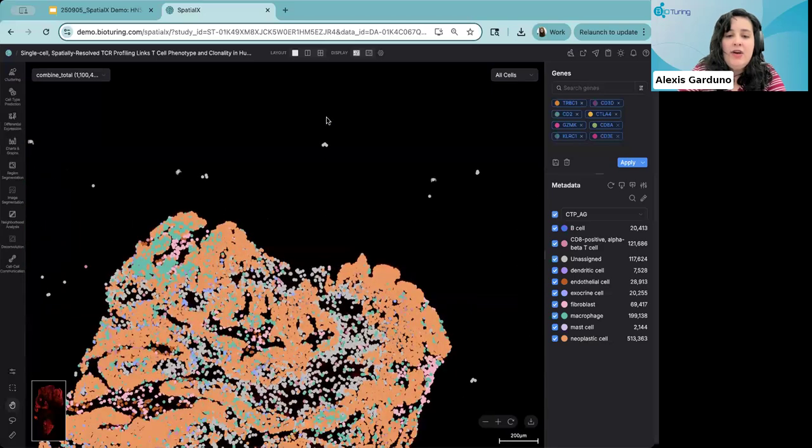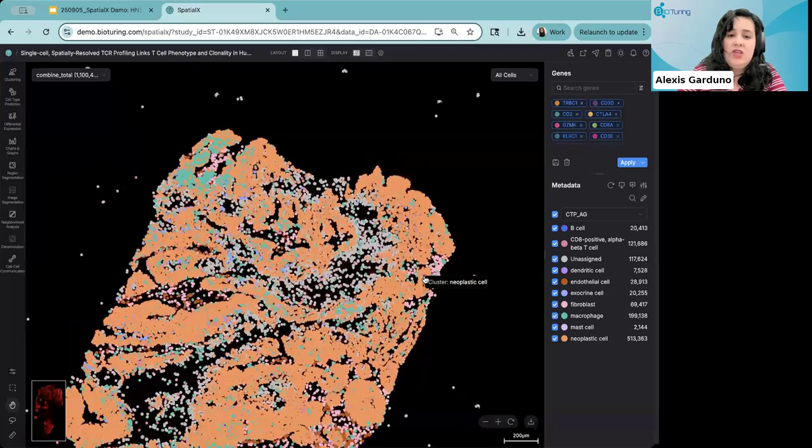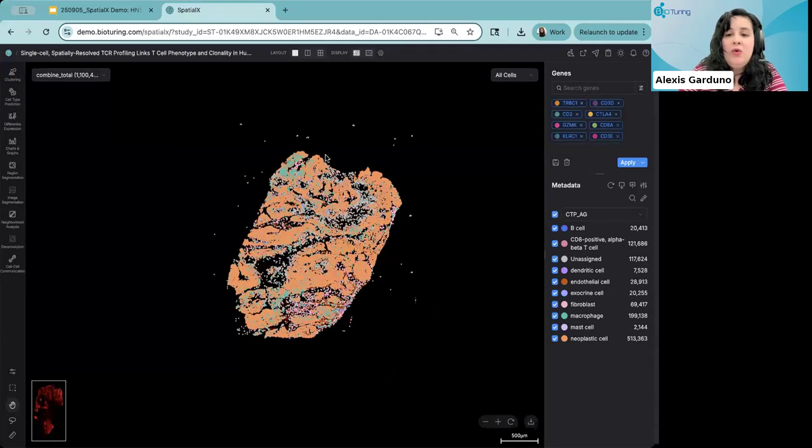in the system, and you're able to get more of an idea of what specific tumor sampling sites have specific tumor cells, which ones have the CD8 exhausted T cells, and what is the distance between these cells within the tumor. So that's another step that will give you this metadata that you can use to run other analysis from here.